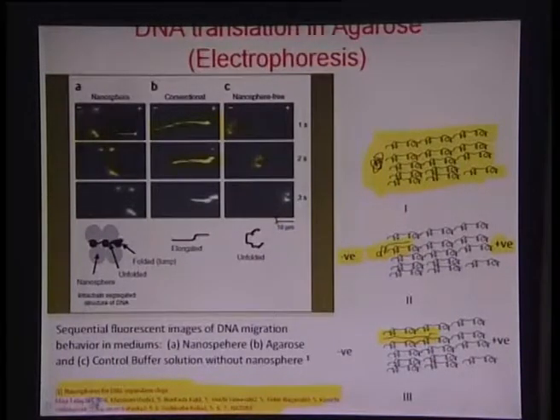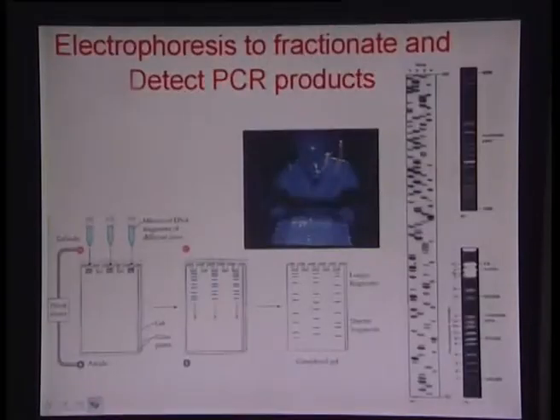Alright. So, with this it brings us to the laboratory aspect of how electrophoresis can be done in a laboratory to fractionate or detect PCR products. So, one aspect of electrophoresis is also how to make visible the DNA stains which are there. So, on a laboratory scale, electrophoresis is used mostly for studying the sizes of PCR amplified segments.